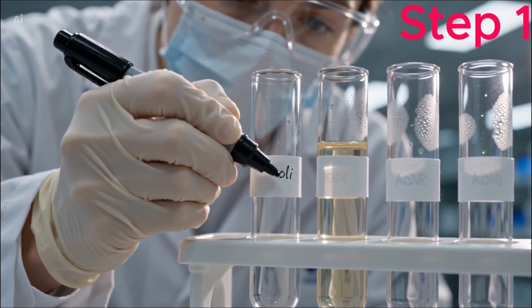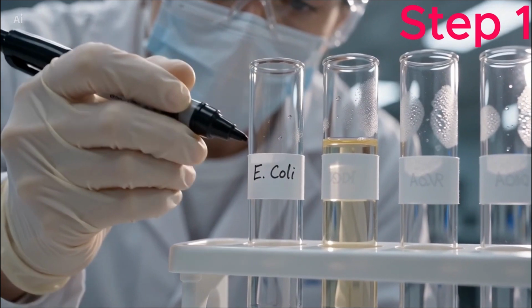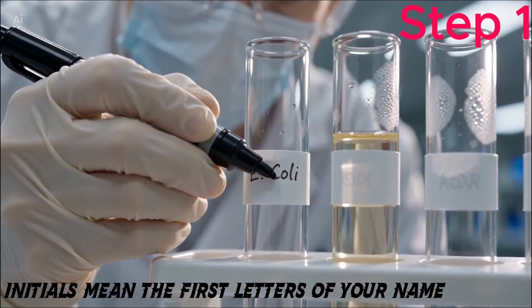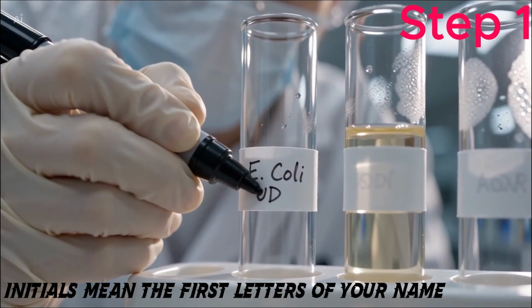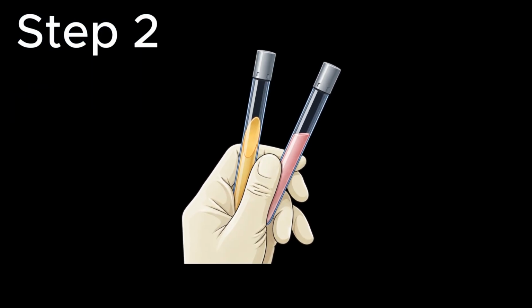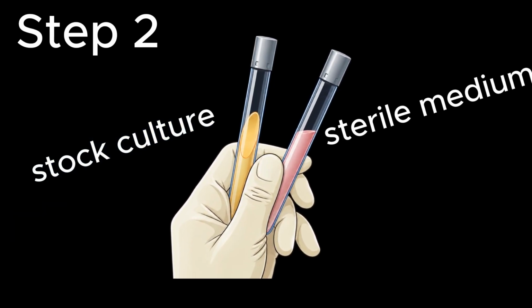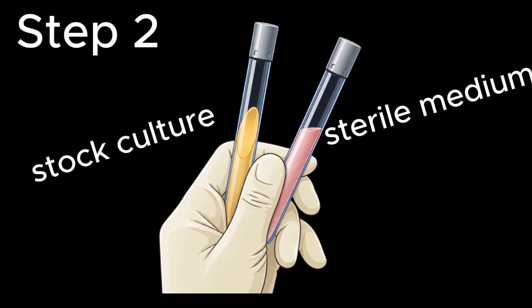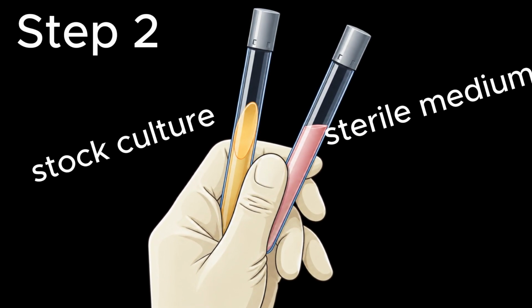Step 1. Label the tubes. The first step is labeling all sterile media tubes with the name of the microorganism and your initials. Proper labeling helps prevent confusion and ensures accurate identification throughout the experiment. Next, hold the stock culture tube and the sterile medium tube together in one hand, forming a V shape. This position allows both tubes to be handled efficiently while minimizing exposure to airborne contaminants.